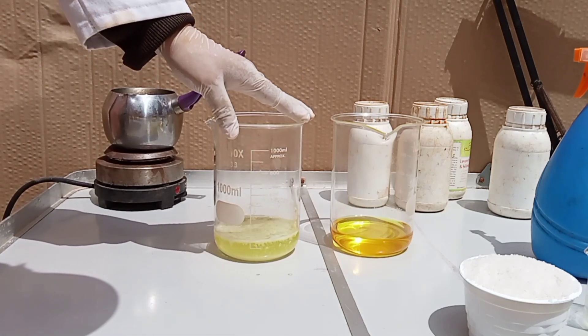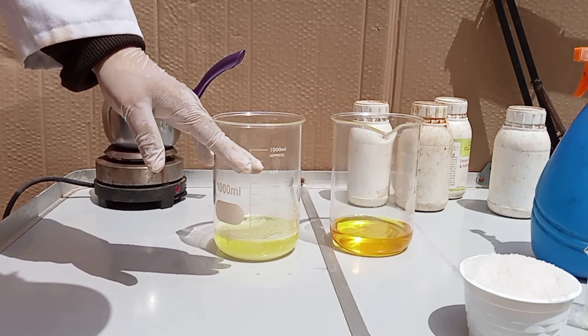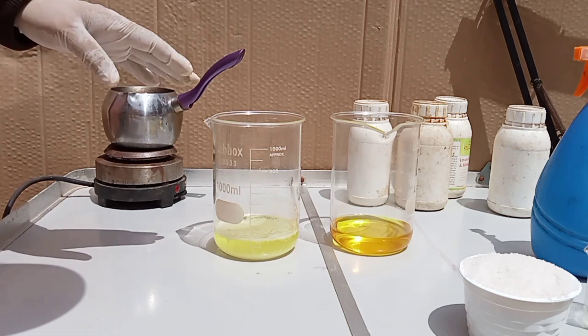The process shown in this video involves highly corrosive acids and should only be done outside or in a fume hood. Using safety gear such as gloves, goggles, and a respirator is mandatory.